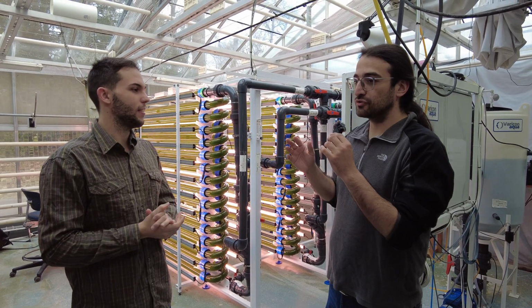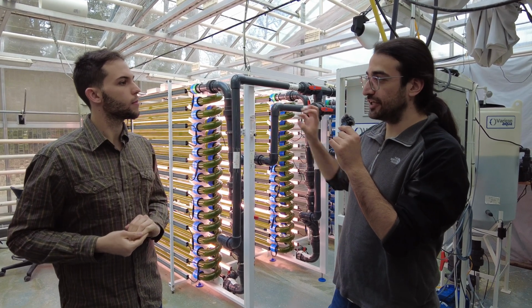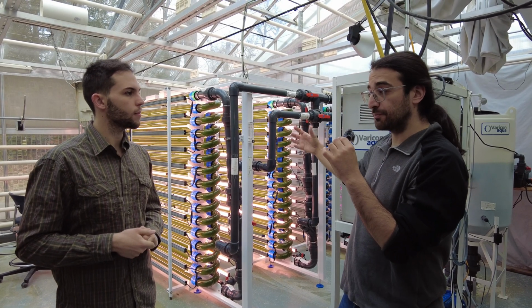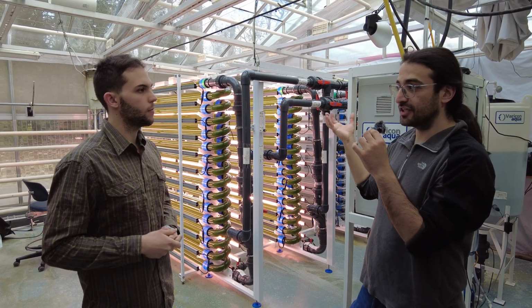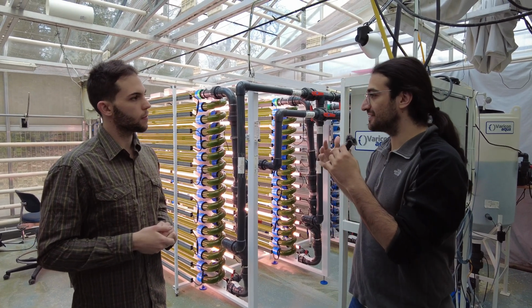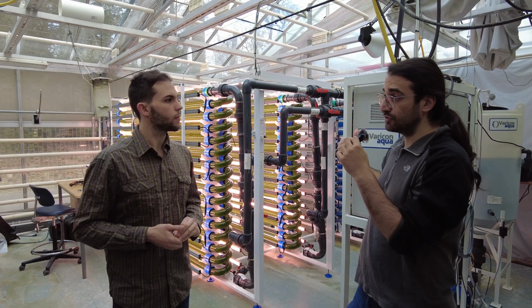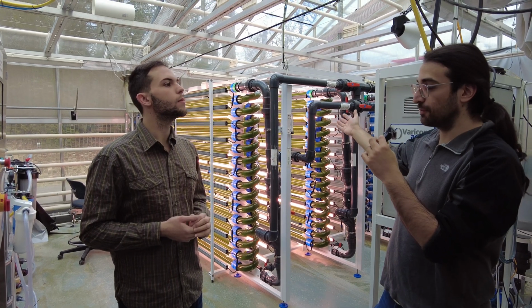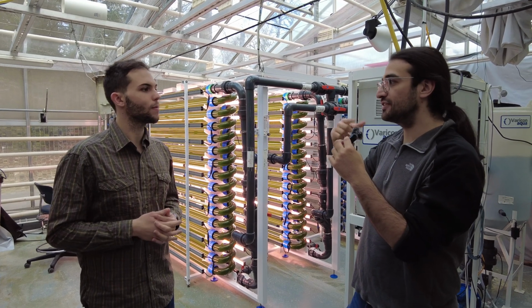Because in this project, we are also doing a waste to product project, and it's quite a circular bioeconomy practice, I can say. We are using wastewater to grow algae, and we are treating the wastewater by producing algae. So that means we are producing algae from wastewater, and we know that our algae has potential to be used as biostimulant, biofertilizer and pesticide, which are high value added products. And those bioagrochemicals can be used in the same greenhouse. So you are seeing a waste to product opportunity. After this operation is done here, algae and the treated water can be used in the greenhouses again.